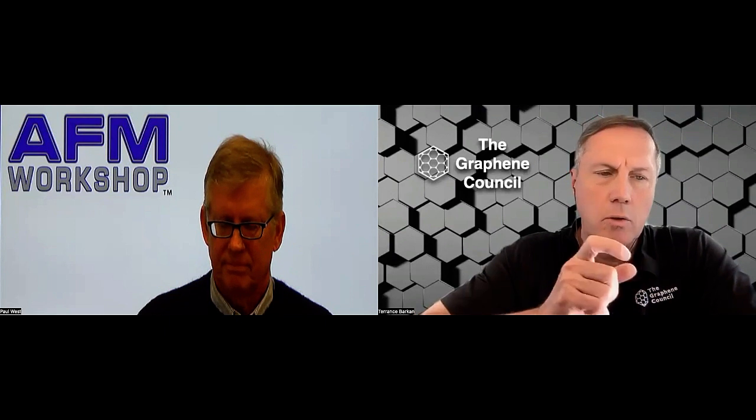Understood. When we're talking about why we're using this microscopy for graphene or for other 2D materials, often it's to characterize it, which may go into a technical data sheet, in which case we want to measure the lateral flake size and the height to infer layer count, that sort of thing, especially with graphene.